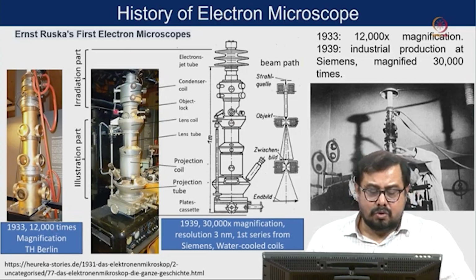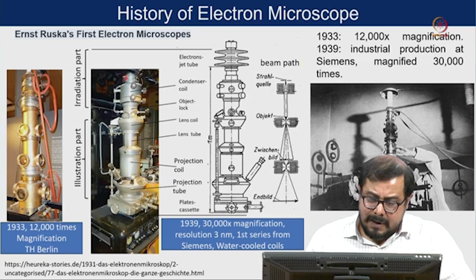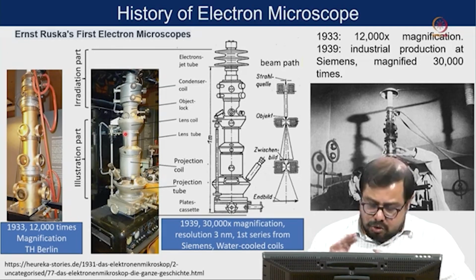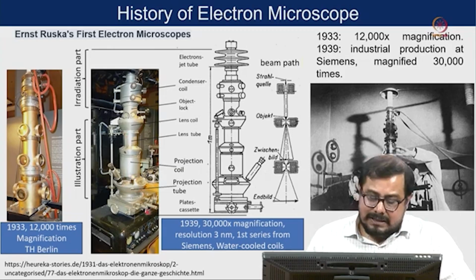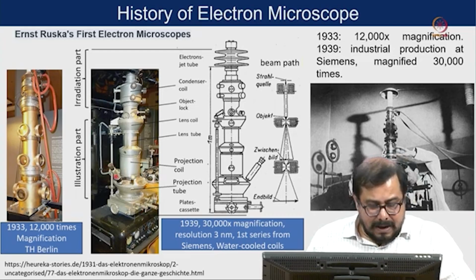In any microscope, we are still using a similar kind of architecture, where we have the electron source at the top and then different types of lenses, that I'll show you in a later slide, and then there is a viewing chamber and there are multiple knobs, and this is the binocular.